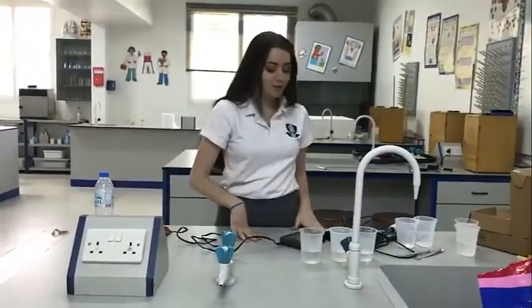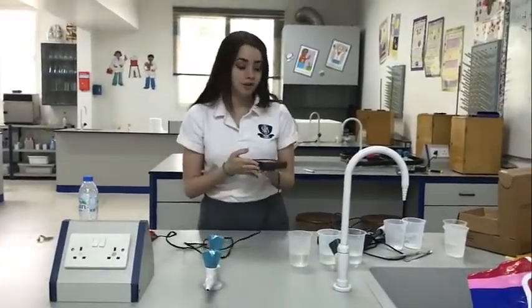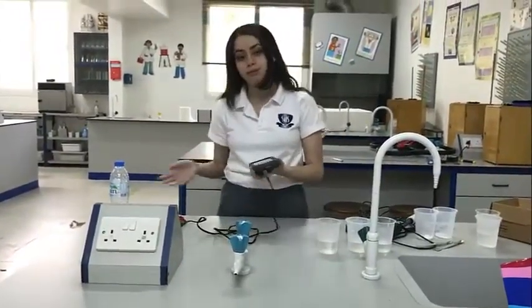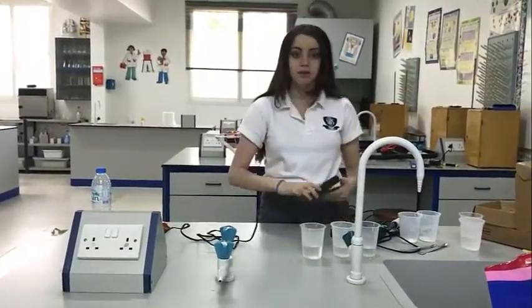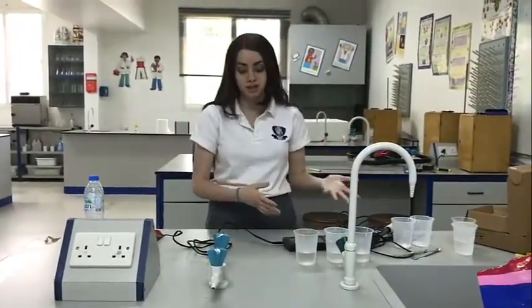School. Today I'm going to be introducing this device, and it's called LabQuest 2 by Vernier. This device captures data in real time and it's really helpful when it comes to experiments, collecting data and sharing it with other group members. It has over 70 sensors, for example, conductivity sensor, pH sensor, current sensor and voltage sensor, and many more. This device can view data in 3 different ways: meter, graph, and table.